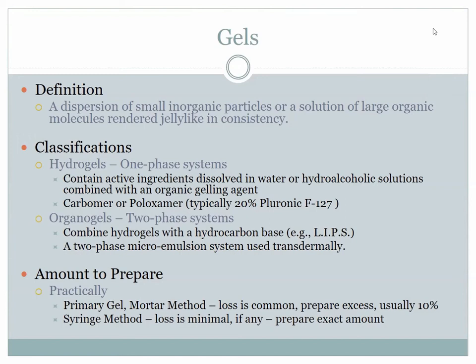Now, I know sometimes they'll put in blue or green coloring just to make it look funny, but essentially a lot of times it's just this crystal clear, bubbly looking thick gel that's got some aloe vera in it. Well, what makes the gel is the carbomer, and that's a classic hydrogel. Water, alcohol, aloe vera, and then this carbomer mixed up to make this gel, okay? And that's an awesome gel.